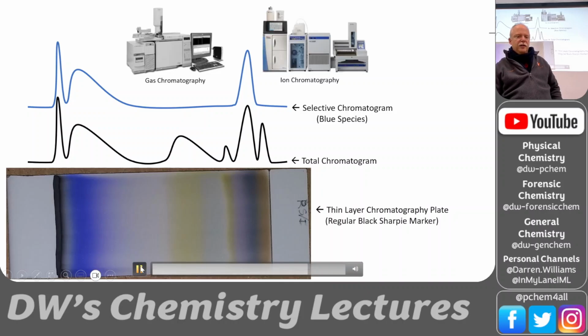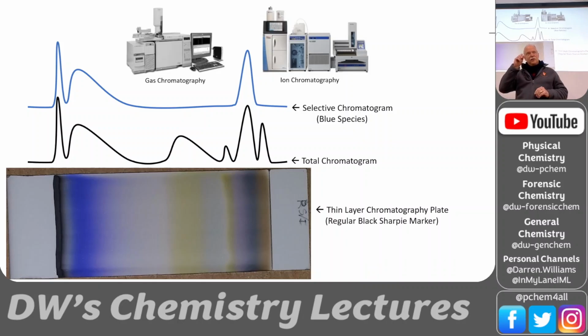Now, some instruments can select an ion. Like if you have a mass spectrometer on your gas chromatograph, you can tune it to a particular ion. Let's say we knew what the blue substances were, and we picked that mass and just monitored it. We could get rid of all of these other peaks, right? So we could just see the blue signal. And so we don't see this one, we don't see this one, we don't see this one.